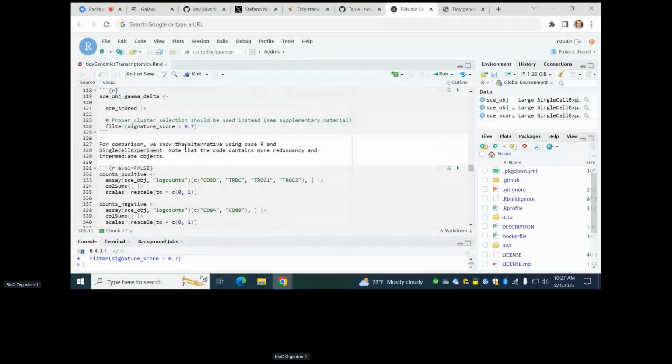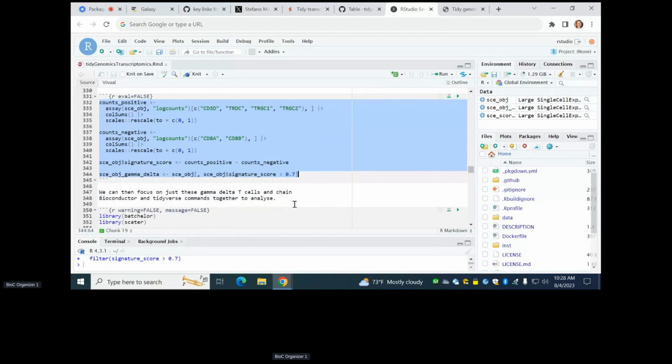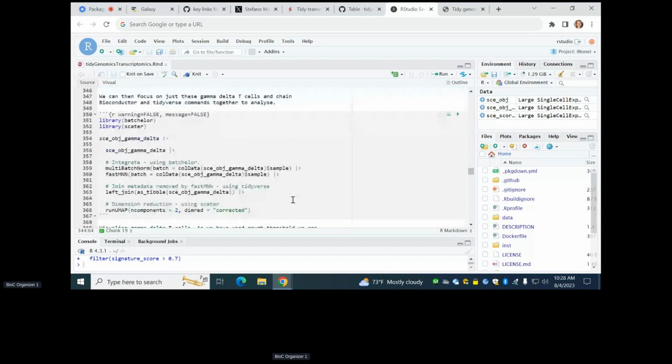There is also the tidygate package, which allows you, in a reproducible and procedural way, to draw gates and create columns in that way. Anyway, no time to explain here, but we can talk later. And this is the alternative with base R. You create a couple of temporary variables, you merge these temporary variables, and it's quite typical. You can see here that you require quite a few commands. It's a bit less elegant, arguably so, than the tidy representation.